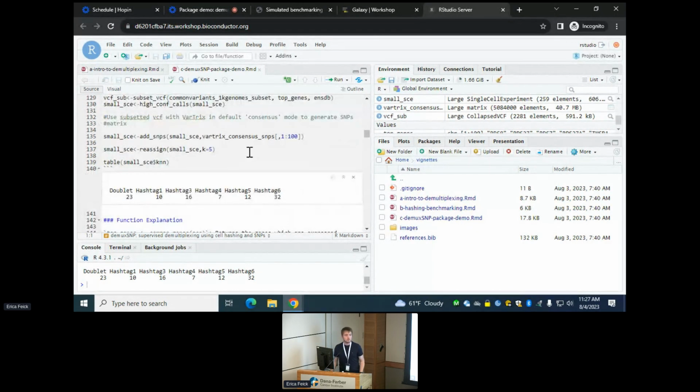So you don't have to have called SNPs on your particular samples? Calling SNPs is part of the workflow. But you're pulling in known SNPs? Yes. So you can call your own SNPs, maybe using something like Freebayes to call SNPs in your data. However, we're generally working on cancer data, so using known variants rather than just calling them in the data reduces the chance of picking up a variant associated with somatic mutation rather than something associated with the group. Okay.